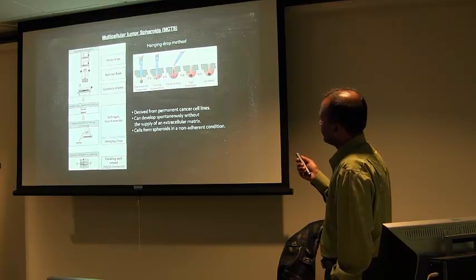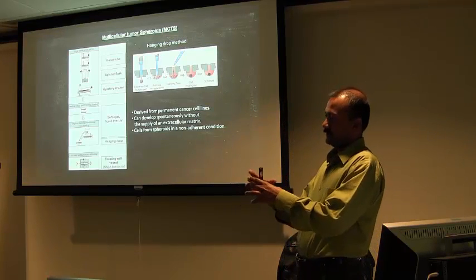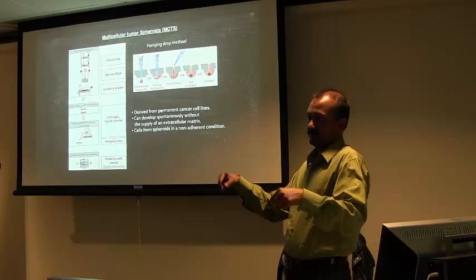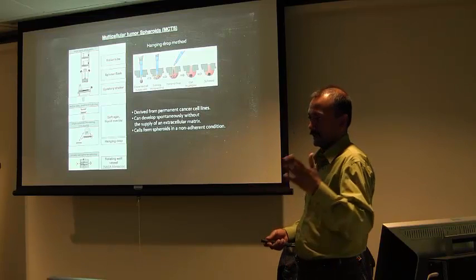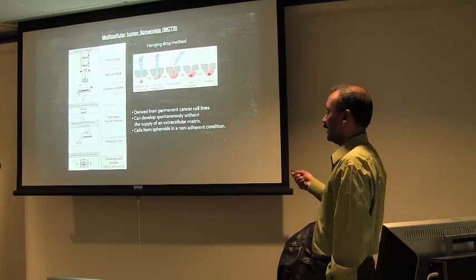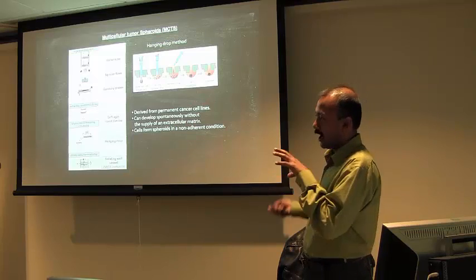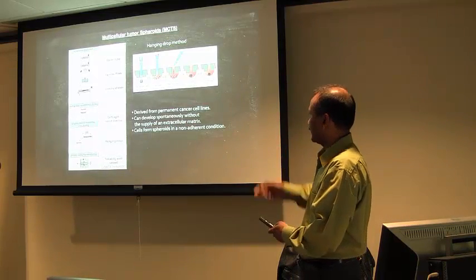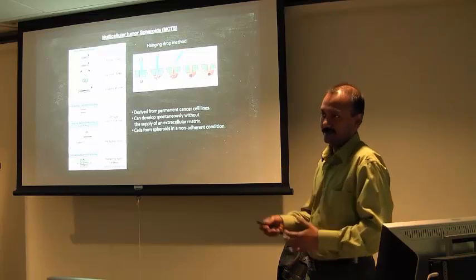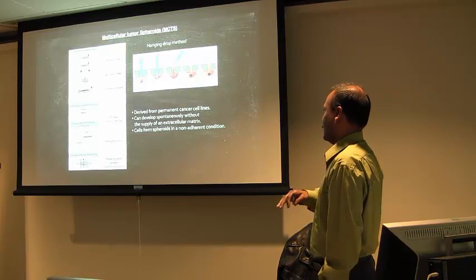One good use of this is in drug discovery research, where you can specifically seed one spheroid per well in these plates in a high throughput format, like 384 well or 96 well format, and then you can have several different concentrations of drugs, treatments on that plate, where every well has one spheroid. So the analysis becomes much easier, because you can look at one spheroid, how it is responding to the drug, and you can add the treatment directly in those drops. You can add 1 microliter of drug to each drop, and it doesn't change the situation in the plate. So this is very popular now in high throughput formats.